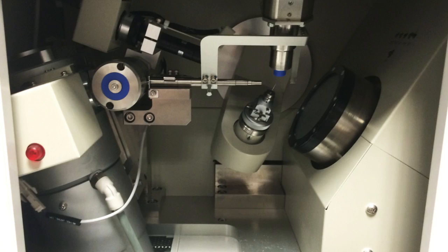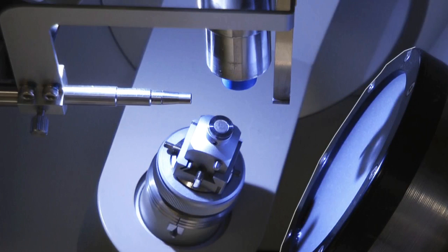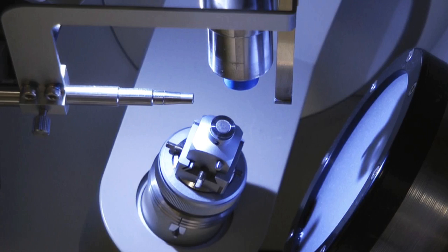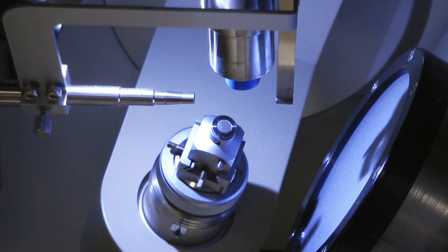Several components make up the single crystal diffractometer. There is an X-ray source, a goniometer head and an X-ray detector. The goniometer head is used for rotating the sample. A beam stop is located directly opposite the X-ray source to block the transmitted X-rays and prevent burnout of the detector. It is a good idea to conduct an experiment at low temperatures, as this keeps the crystal stable and lowers the thermal motion of the atoms within the crystal lattice. Therefore, we have this low temperature device.